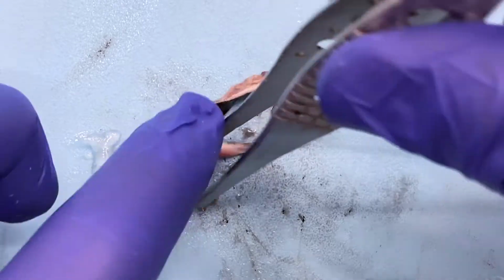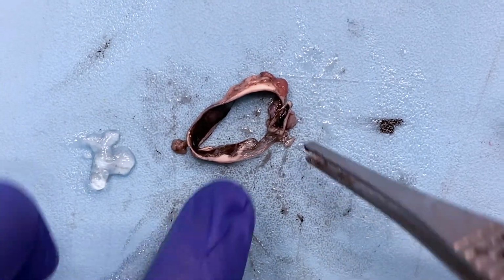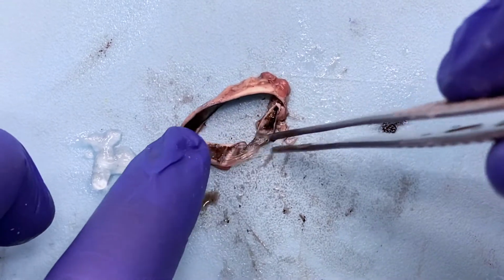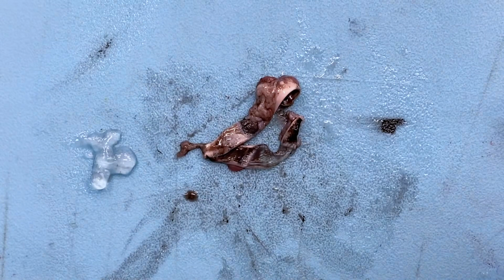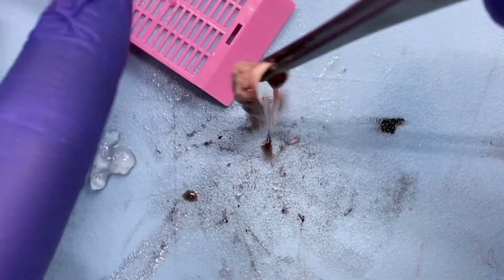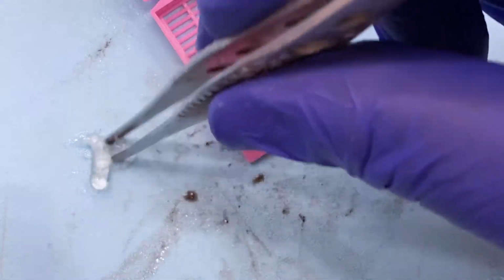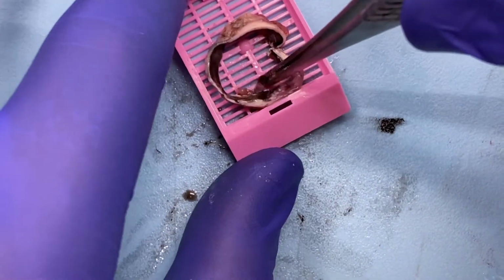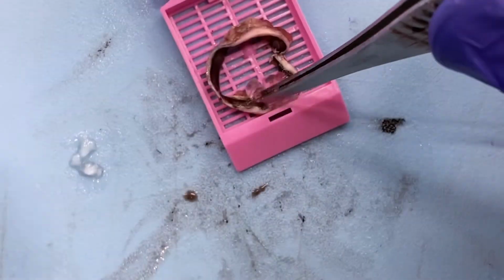So let's see if you can clear it. Over here, this clear area, if you can kind of make that out, is going to be where our pupil was. And then we can flip it over, and there's our optic nerve. So I can now stick this into a cassette, knowing that I've got everything attached. I'm also going to stick my lens in there, so they can hopefully cut that and see a relationship there, at least a portion of the lens.